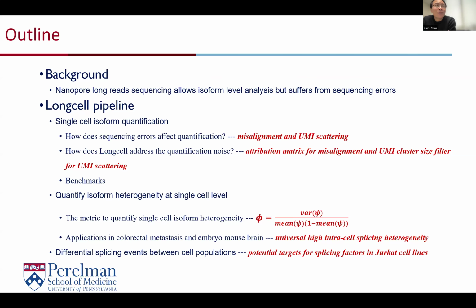That's actually very wonderful insight. It does provide that biological importance. One of your results did show that when you knock out one regulator, the distribution of the heterogeneity was altered.